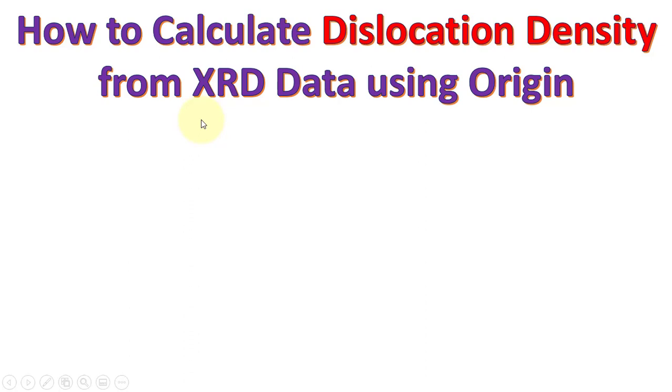In this video we will discuss how to calculate dislocation density from XRD data using Origin.